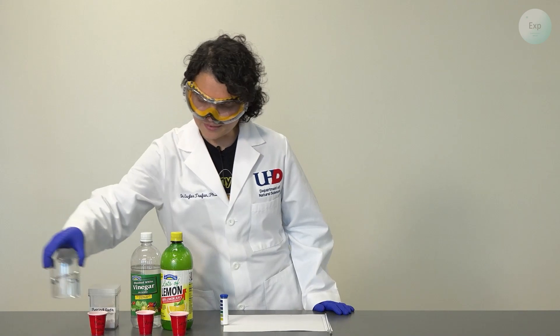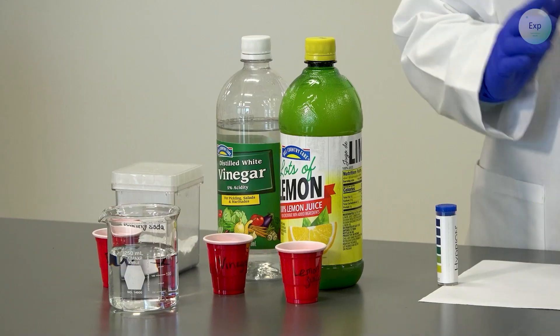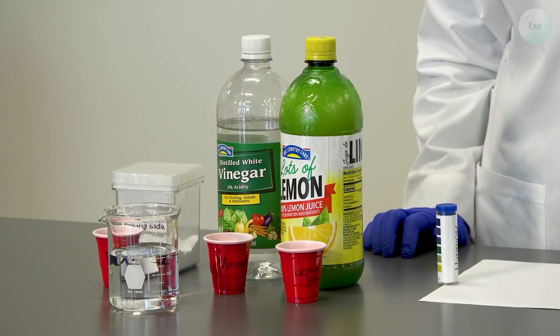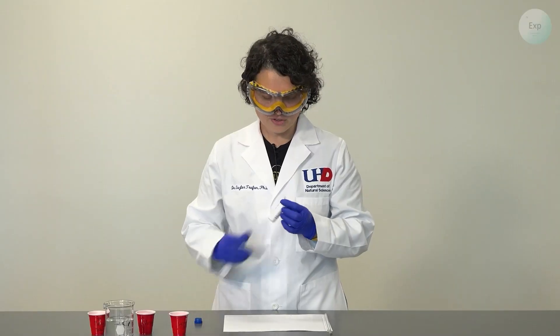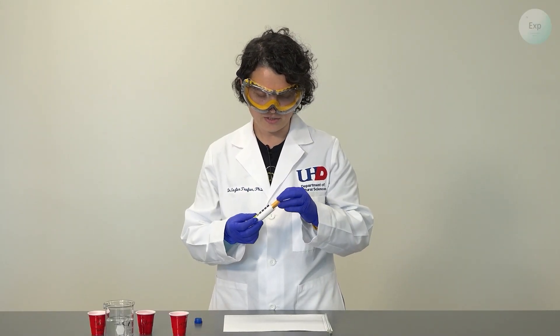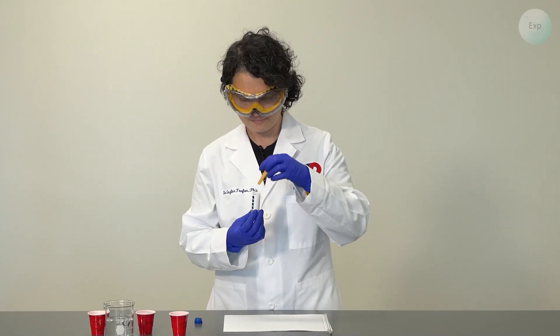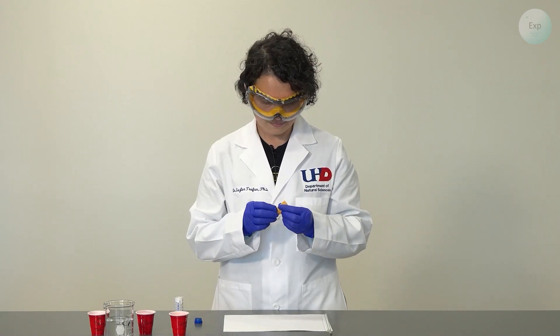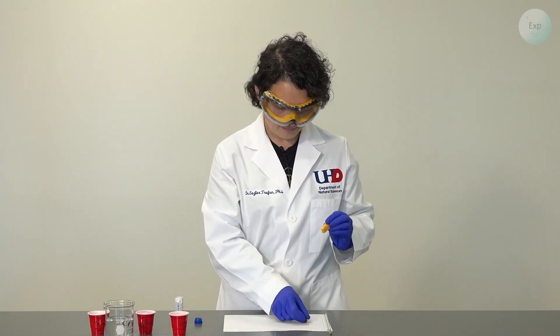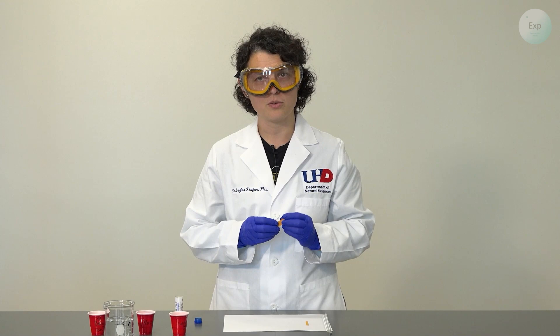And finally I am going to need some deionized water to clean my glass stirring rod in between measurements. So let's get started. The first thing to do is extract the pH paper. And for each measurement you really don't need a whole strip but you can use the whole strip.